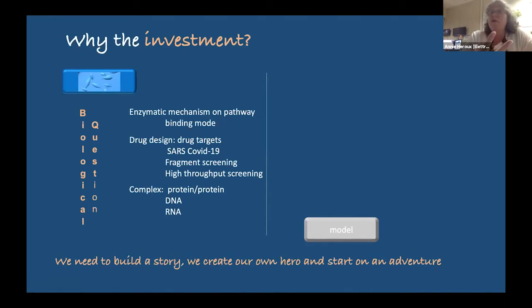And you have a wide range of reasons, covering all your questions: enzymatic pathways, drug design. I mean, there's been a huge push on getting structures for SARS-CoV over the last year. So a lot of the beamlines have dedicated a huge amount of time to doing those structures. And just yesterday I was listening, and at Diamond Light Source, over a year they collected more than 14,000 data sets. And for that, they have less than 5% hits with something inside that they actually crystallized with. So there are a lot of structures with nothing that you want to see.